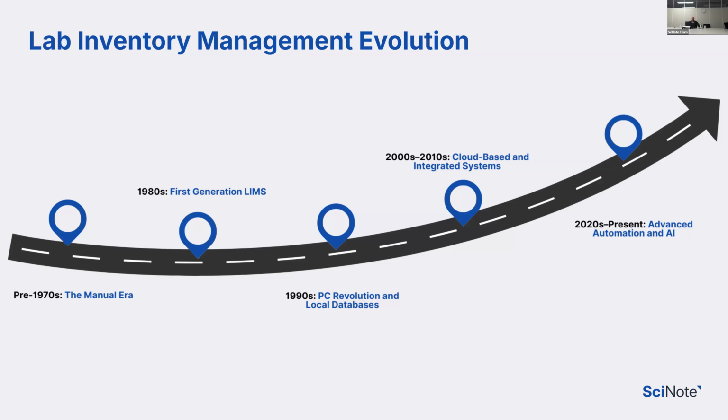What was probably the biggest issue with that, based on our research, and this is true for almost all the phases that I'm going to talk about, is that inventory knowledge lived in people's heads. So if somebody, the elder of inventories, left, you suddenly had a big hole to fill because you didn't know what's happening in the inventories, what's missing, what's not.